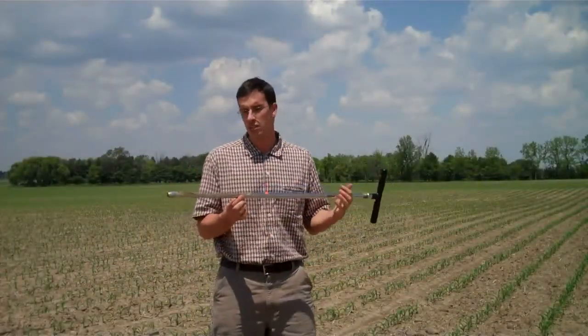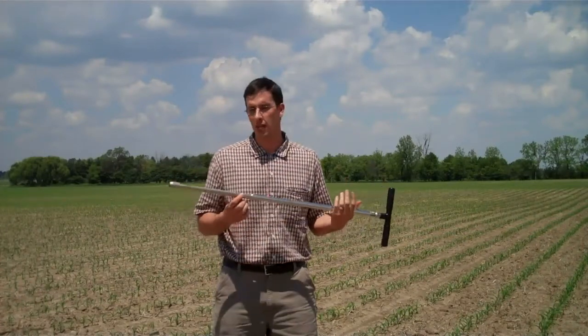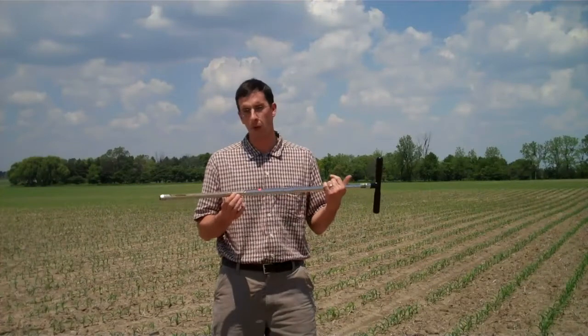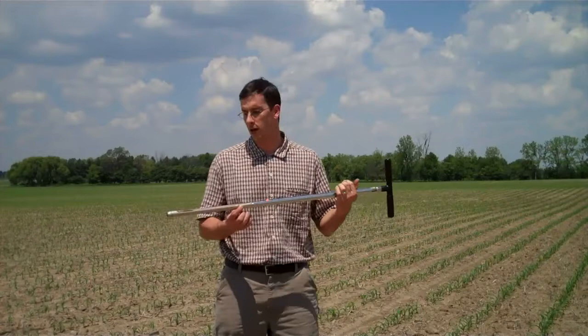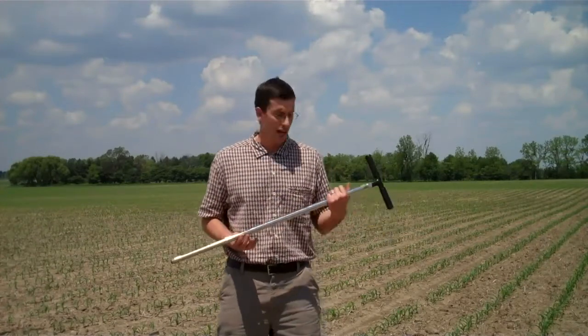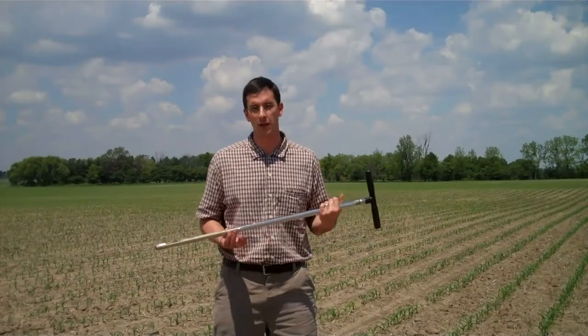For pre-side dress nitrate testing, you need a soil probe that can go down at least 12 inches into the soil. Often this time of year the ground is getting a bit hard, so you might need a probe stout enough to attach a slide hammer to. Recently we've had enough rain where slide hammers are not necessary and it's much easier and faster just to push the probe into the ground down to a depth of a foot.